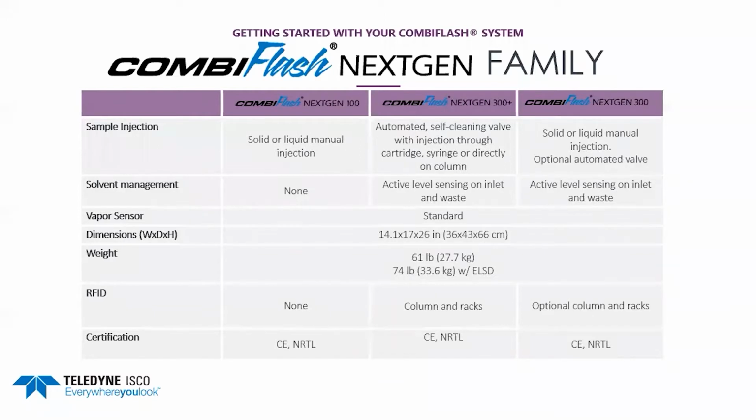RFID tags allow the system to load default methods. However, users can also manually select the column size and type they will use. Rack RFID loads the correct rack pattern automatically for the fraction collector and also the correct tube volume.